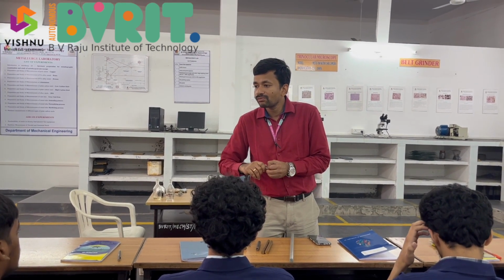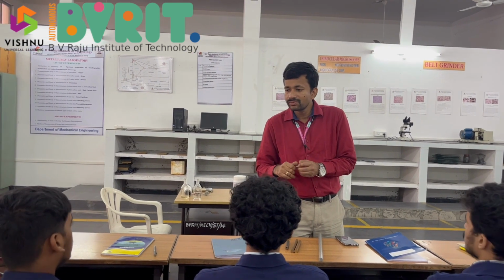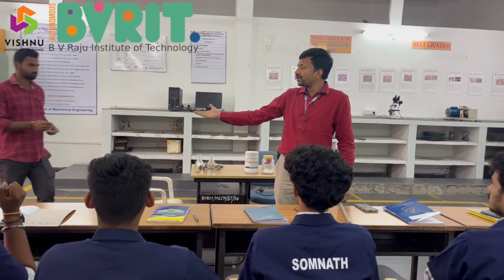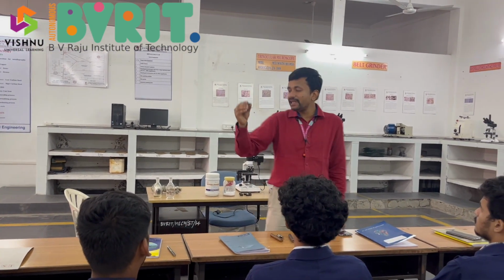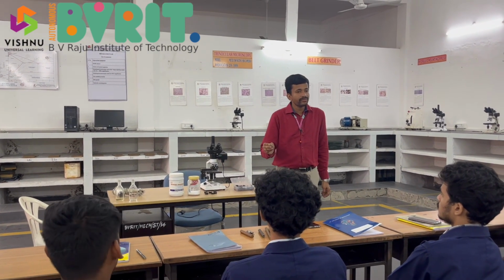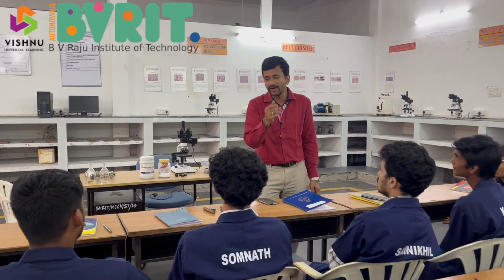It is not possible. Why do you think it is not compatible? Even if I cut into small pieces like this, can I just directly place it under the microscope and view it? No, sir. Why not? Light source, very good, exactly.